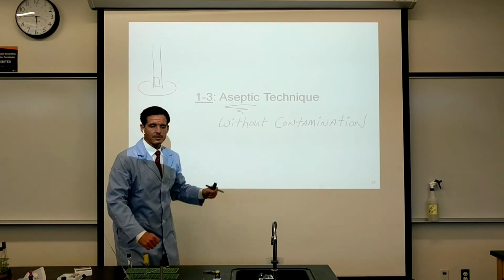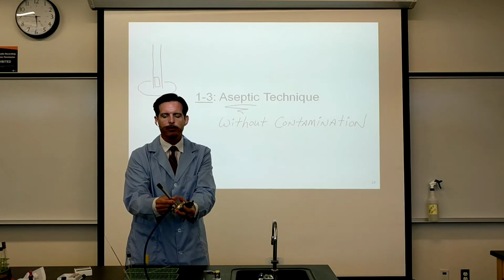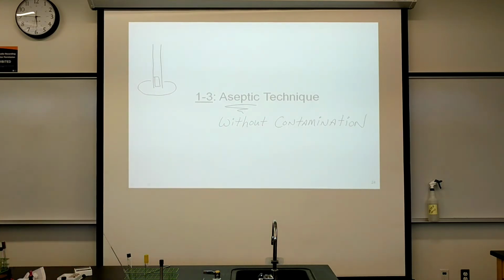If you close the Bunsen burner holes by rotating this little metal sleeve that can open or close the holes or partially close them, you're going to start to restrict the fire. We really want the Bunsen burner holes to be open. The only time I know that we close them is if you're having difficulty keeping the flame lit. Occasionally there can be some carbon buildup or something that could cause the holes to not function optimally. So we're going to keep the holes open for air.